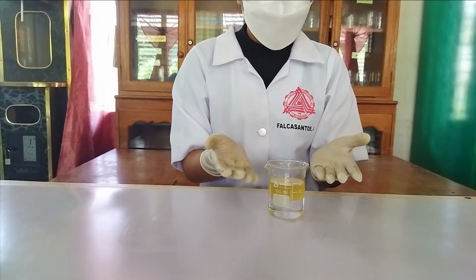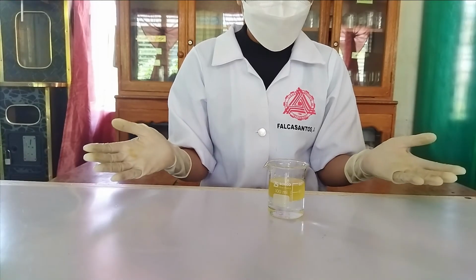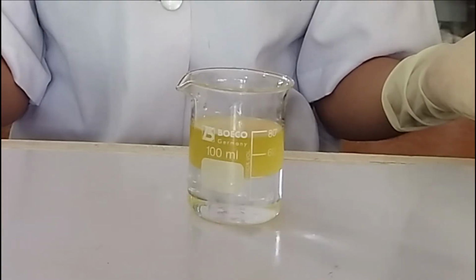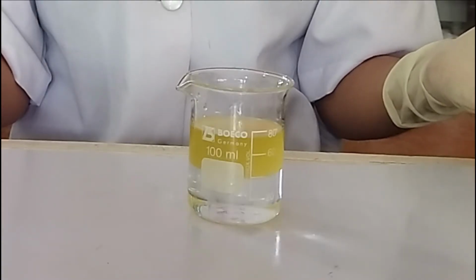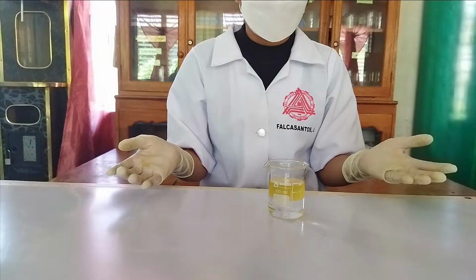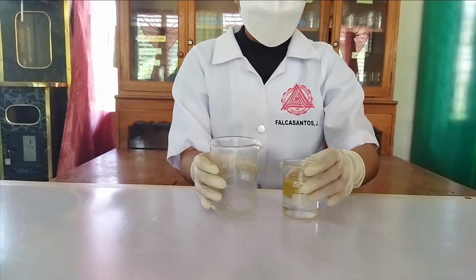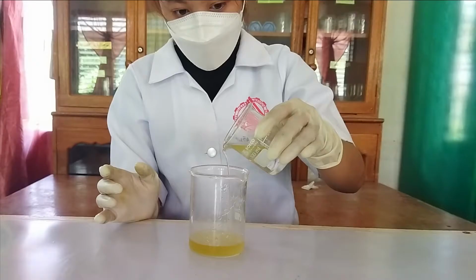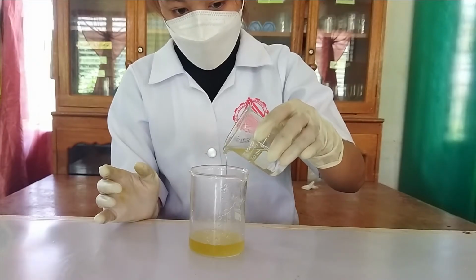This process can also be used to separate two liquids that do not mix with each other, for example, oil and water. When we leave a mixture of oil and water, two separate layers are formed, with water at the bottom and oil, being lighter, at the top. We can remove the oil layer from the top by pouring it into another vessel, which leaves us with the water layer at the bottom.